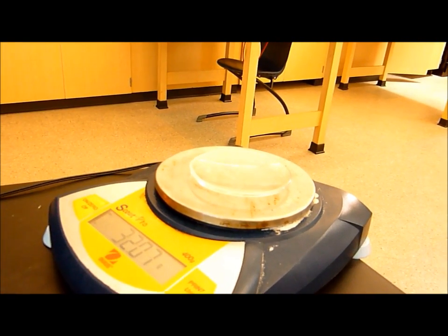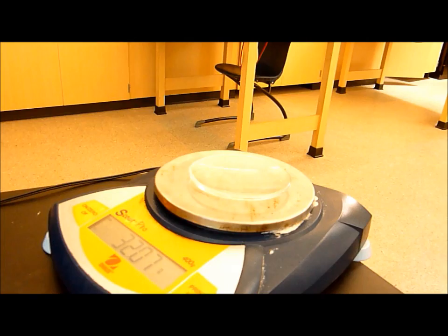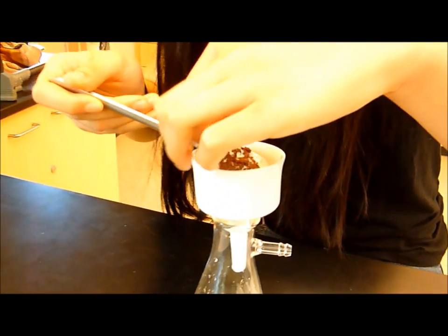So, there is a piece of filter paper in the funnel. So, we're going to take out the piece of filter paper and scrape all of the copper onto the watch glass.